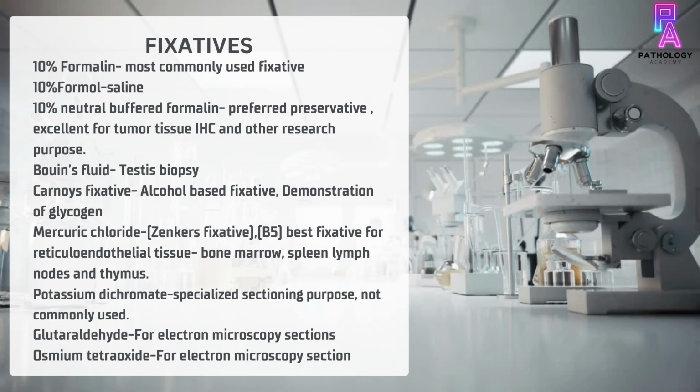The most commonly used fixatives are formalin-based fixatives. The different formulations used are 10% formalin, 10% formal saline, 10% neutral buffered formalin. 10% neutral buffered formalin is the most preferred preservative or fixative and is excellent for tumor tissue, IHC and other research purposes.